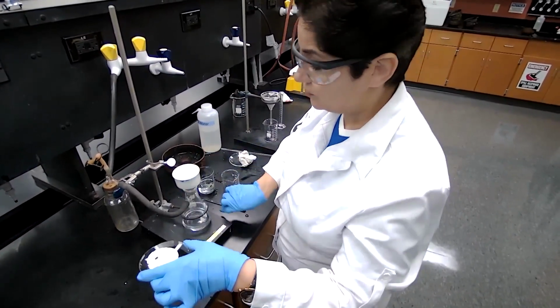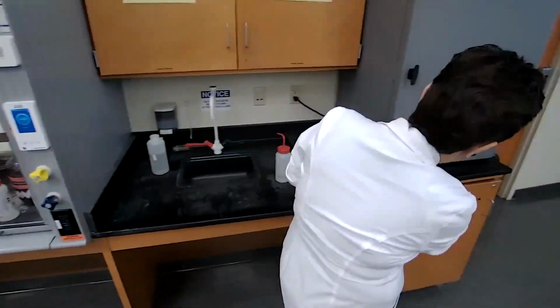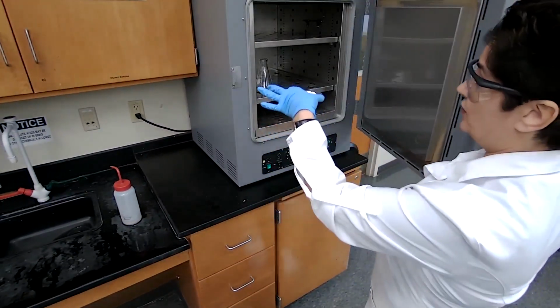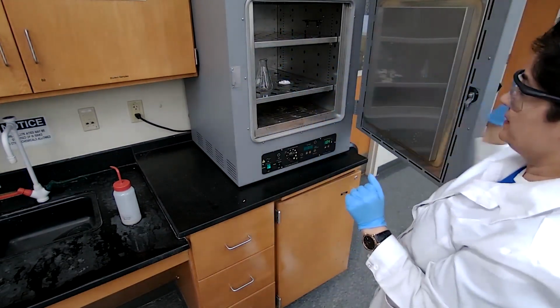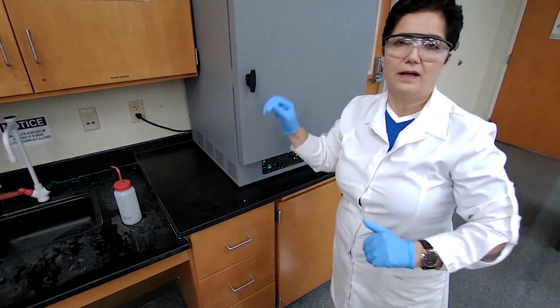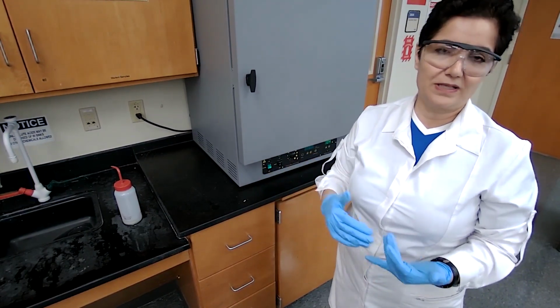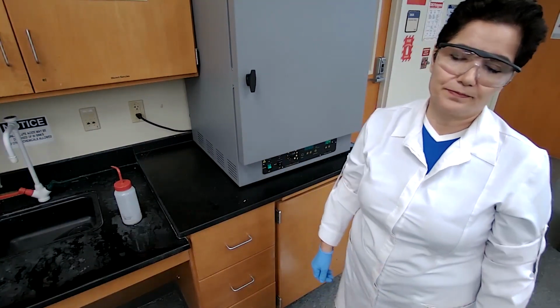After transferring, we're just going to place it in the oven. The oven is already heated. It shows about 104, which is higher than the boiling point of the solvent we are using. We wait for 5 minutes for the solvent to dry, and then we take the sample, measure the mass, and measure the melting point. We need the mass and the melting point to write our lab reports.